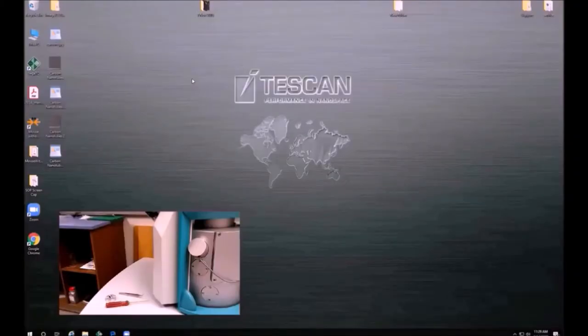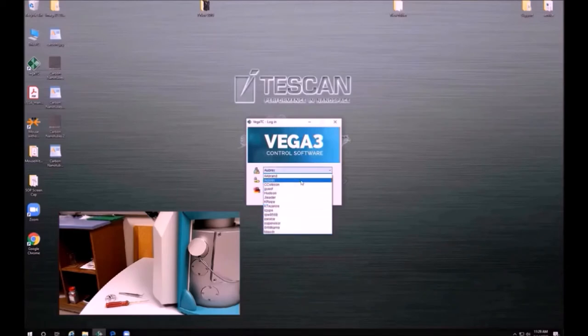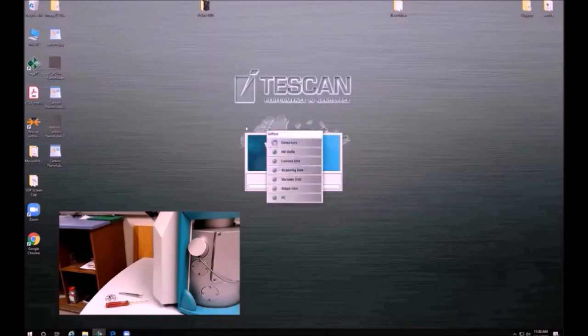Now we are going to go over the necessary steps in order to load a sample into the instrument. You will start by clicking on the Vega TC software. After you have been trained on the SEM, you or your research advisor should be given a profile that will show within this box. You will be able to see exactly how I'm uploading the sample on this portion of the screen.